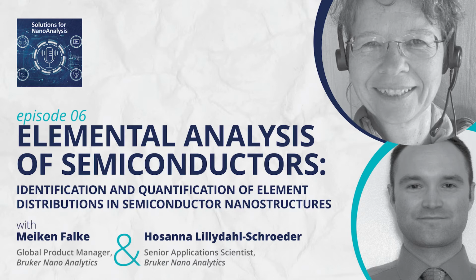I am called Global Product Manager TEM EDS, and that means I'm responsible for energy dispersive X-ray analysis on electron transparent samples or specimens with really small structures, nanostructures. And the responsibility within Bruker includes everything connected to product management. So application, R&D, hardware, software development, bringing the developments to market and making sure that we stay on track with what we do next.